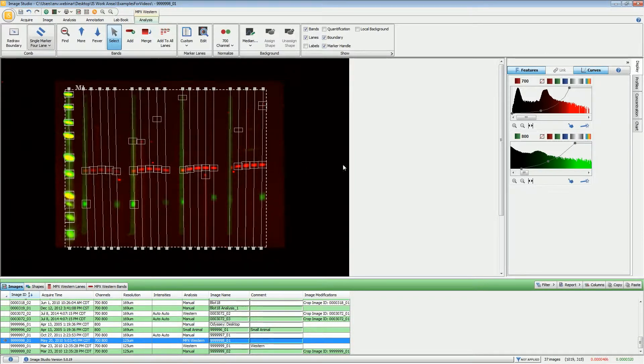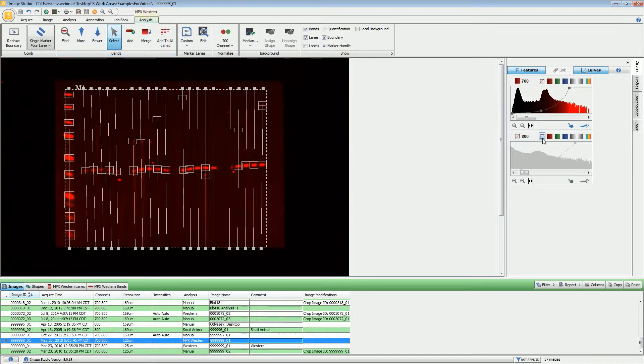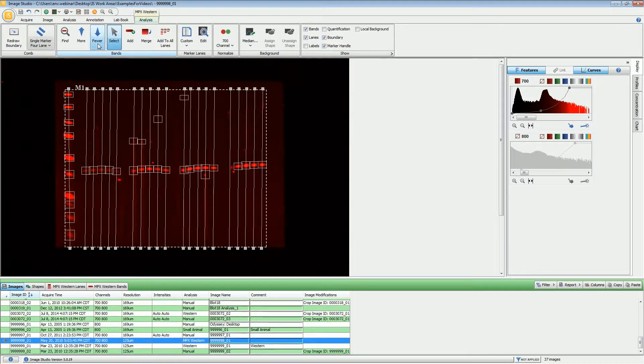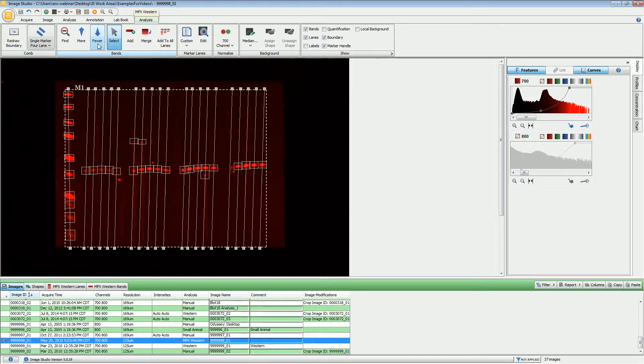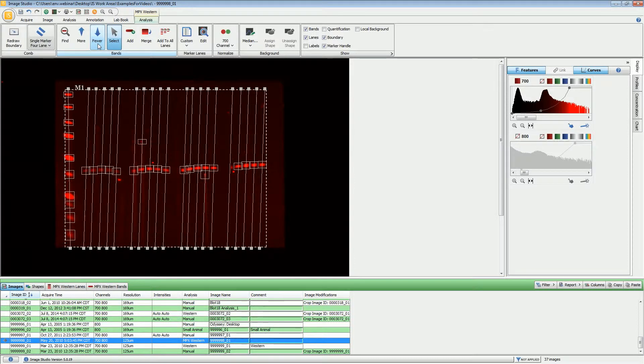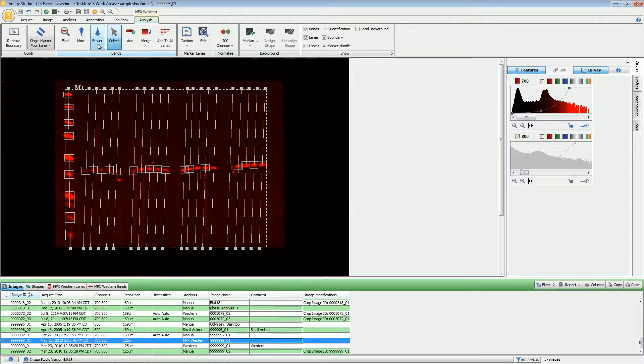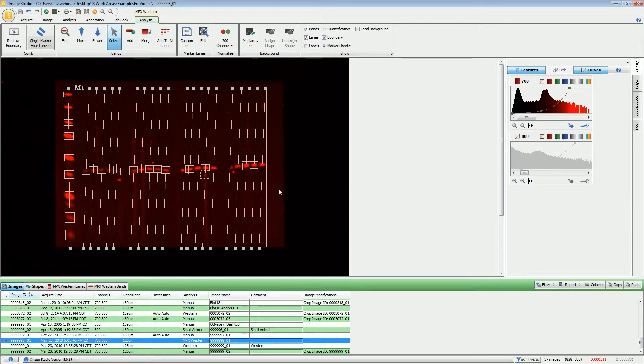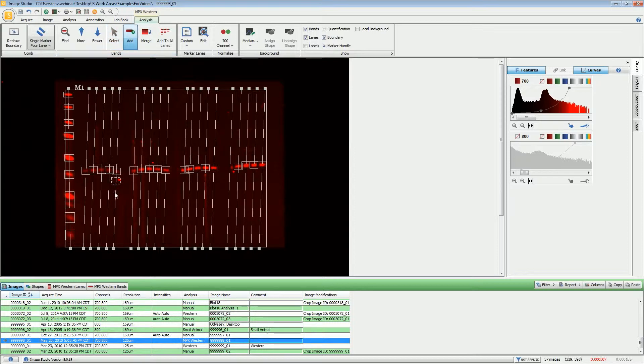The first thing that you want to do at this point is to adjust the band finding sensitivity. Normally you will want to switch over to single color mode and then you can adjust this using the more or fewer options. If using the more or fewer does not give you what you need, you can highlight one of the particular bands if it's not needed and click the delete button on your keyboard.